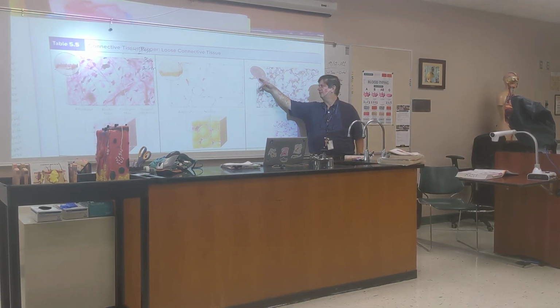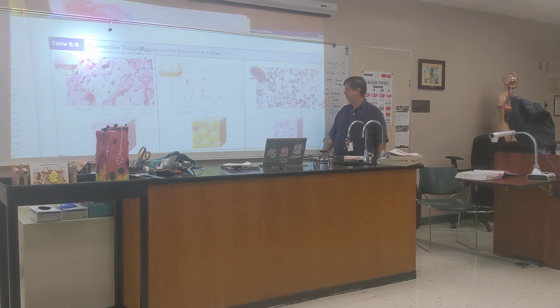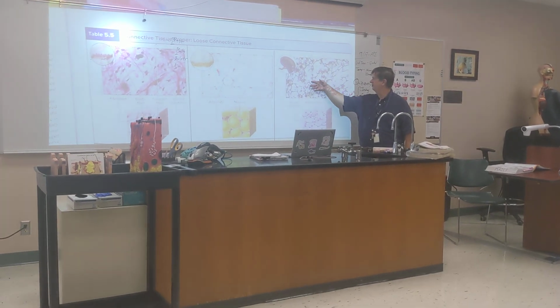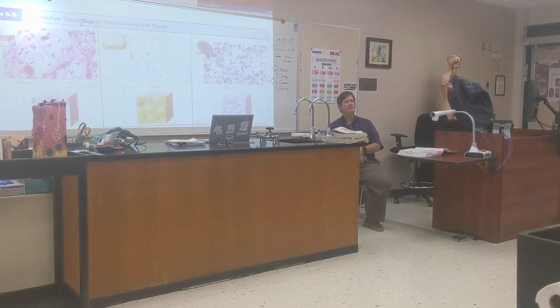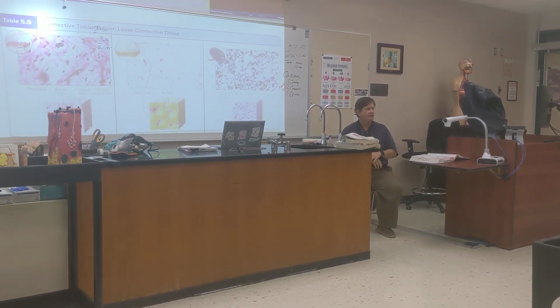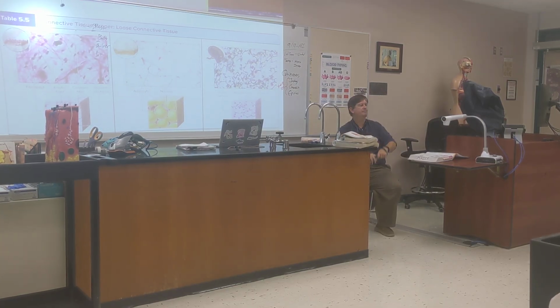This picture tells us this is the spleen. But it could have been a lymph node too, part of a lymph node. But so you have these reticular fibers, you have this space in between, you have these white blood cells hanging out here. You know what's going on there? It's part of the lymphatic system. You've got all the lymph going through all that open space, and the white blood cells are sitting there just watching. I know how to explain it.